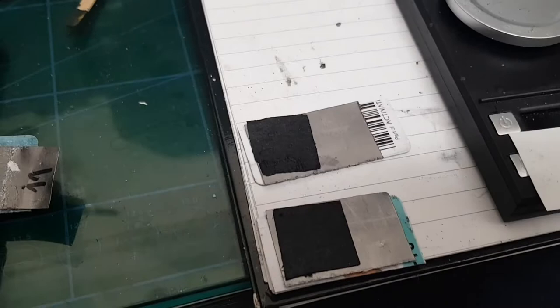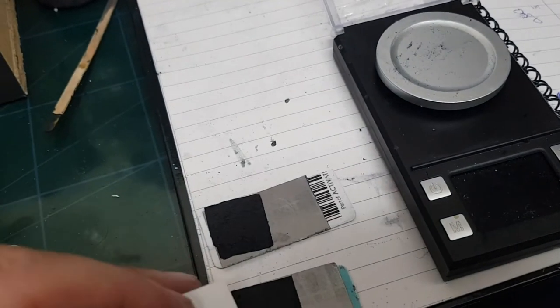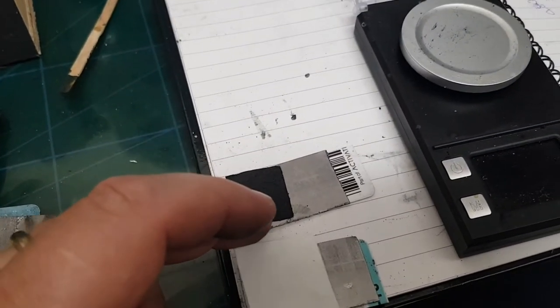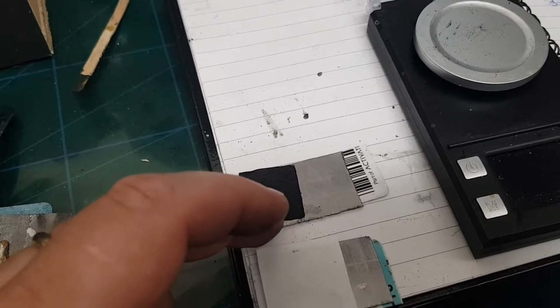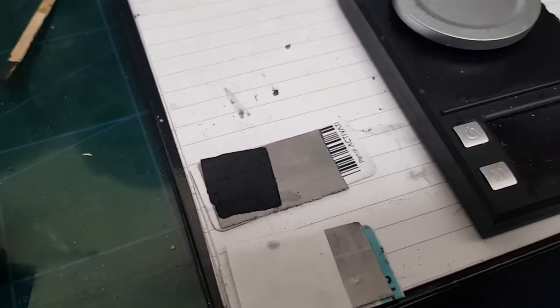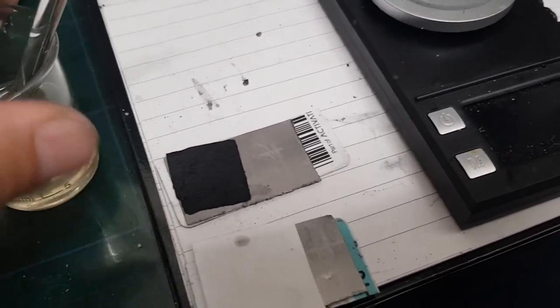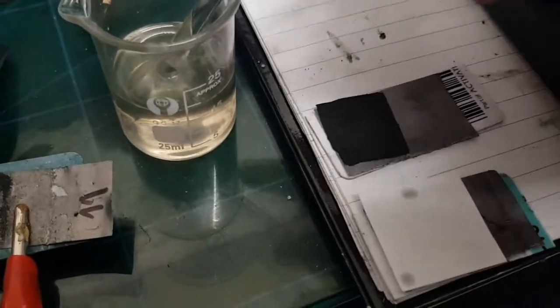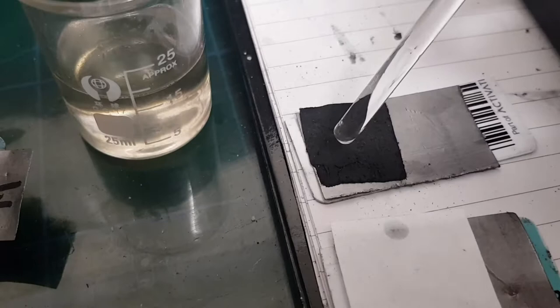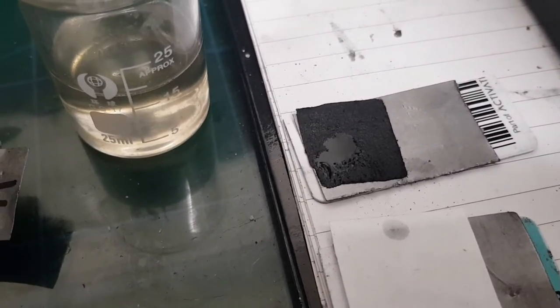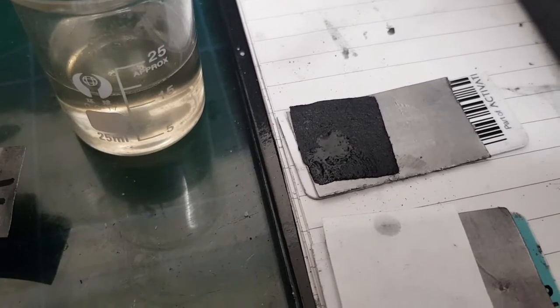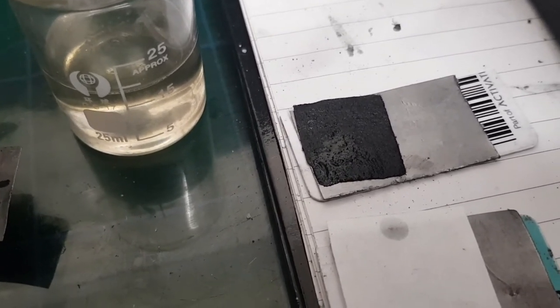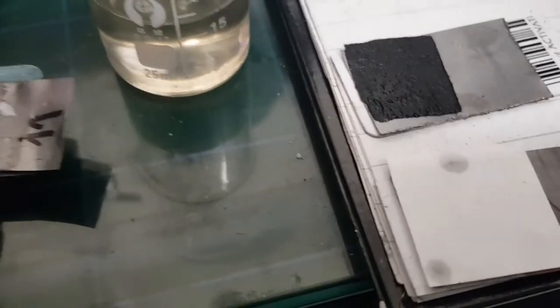The two electrodes are ready. I'm going to add the separator. I already managed to destroy this one a little bit because it absorbs the electrolyte very very quickly, very very well. And that's it, it's inside.